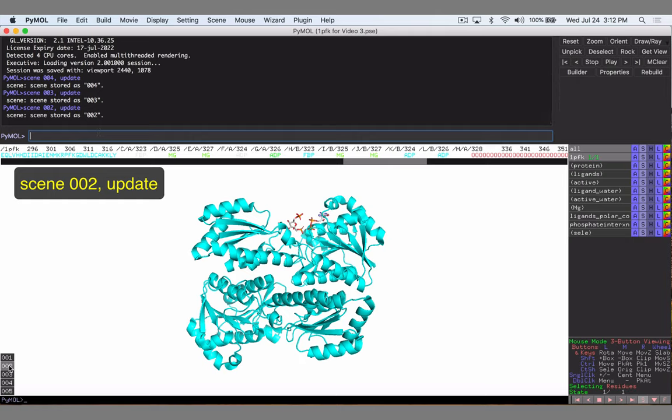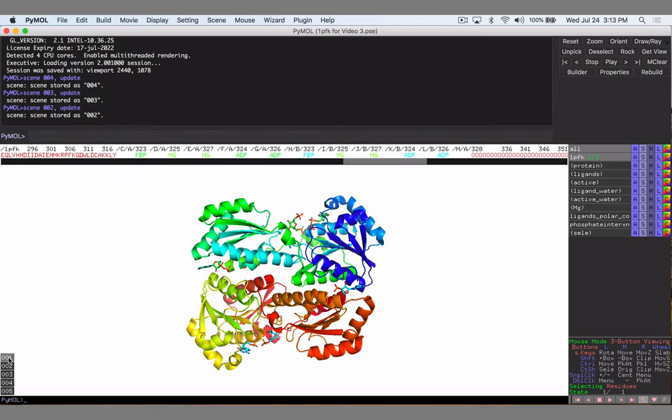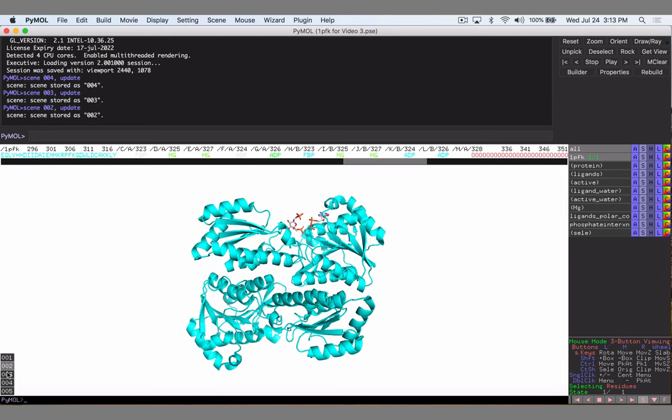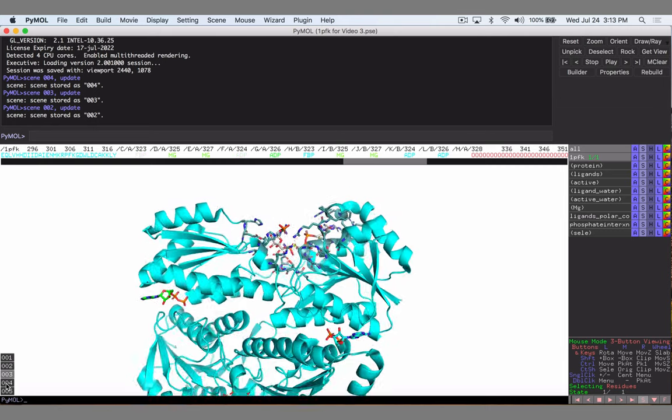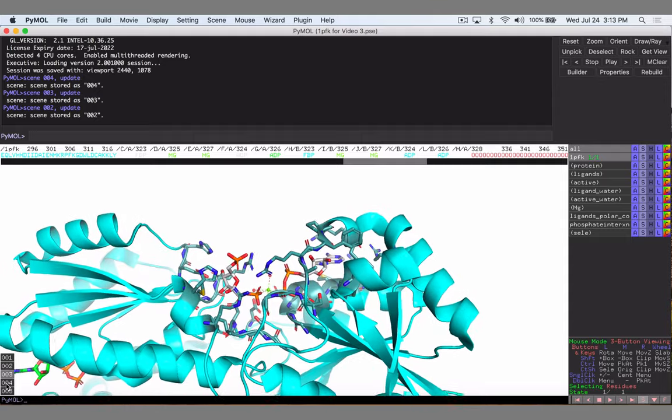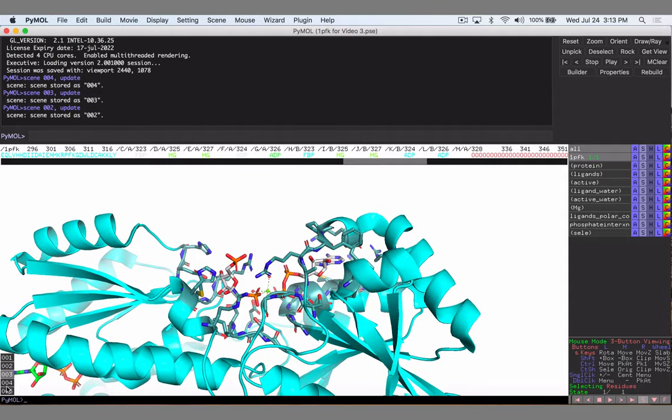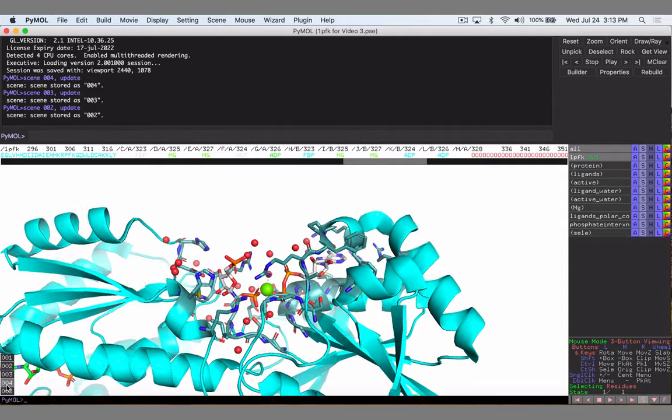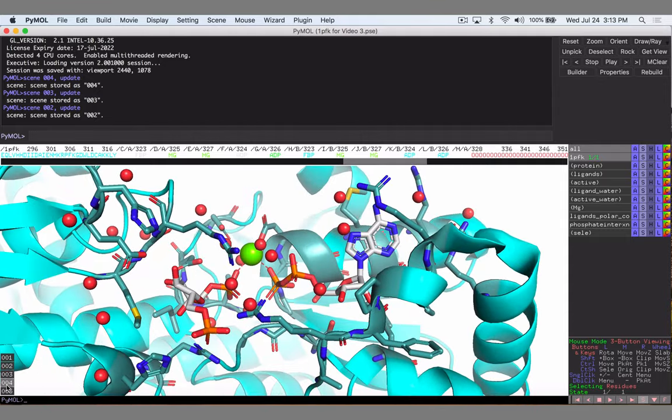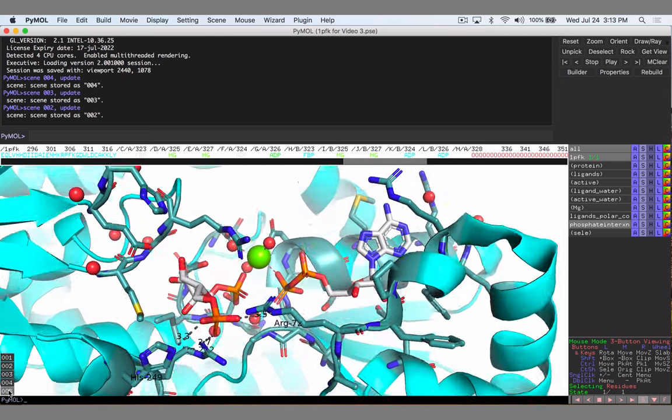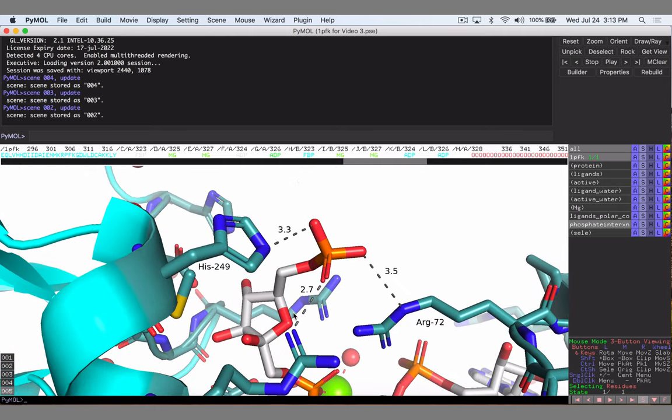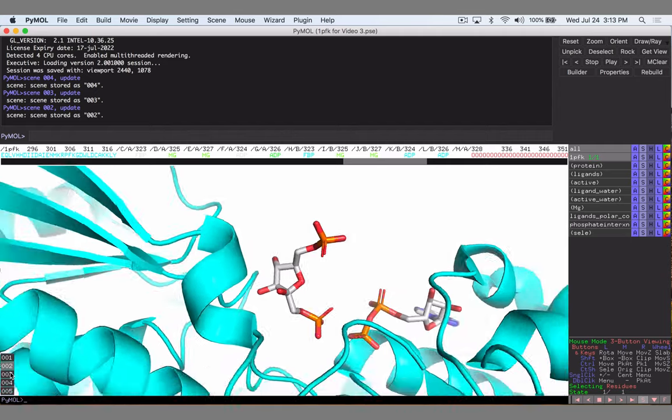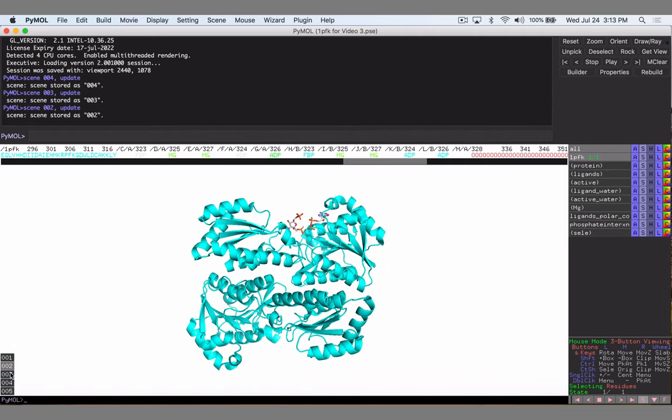So let's just check by clicking through. We had scene 1 as well that was the rainbow. I don't think we'll use that in this one, we'll just stick to this. Scene 2 zooms in a little bit, adds the water, and zooms a little bit more. Then scene 5 zooms in on our interactions with the phosphate which maybe we want to highlight. So we're going to put those elements together in a movie and we're going to start with scene 2.